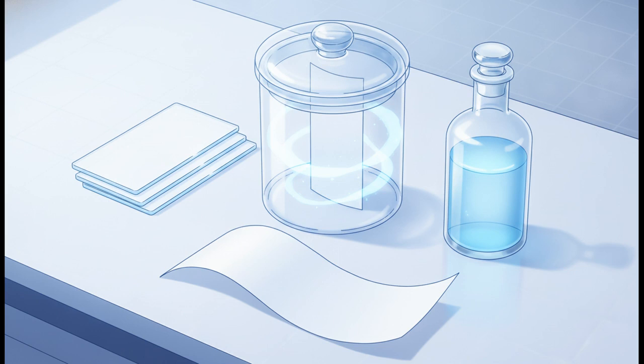Adding filter paper to the chamber creates a reproducible, saturated vapor atmosphere. This stops the solvent from evaporating off the plate during the run, which totally prevents those weird edge effects and keeps your chemical spots from tailing and smearing all over the place.